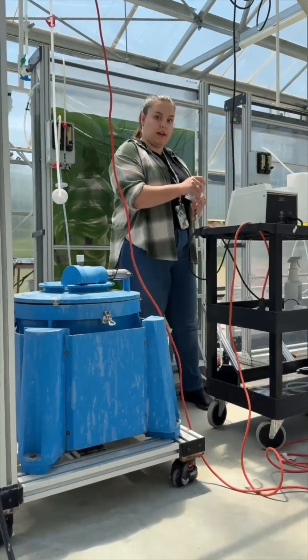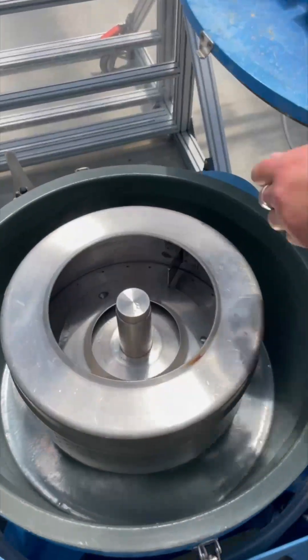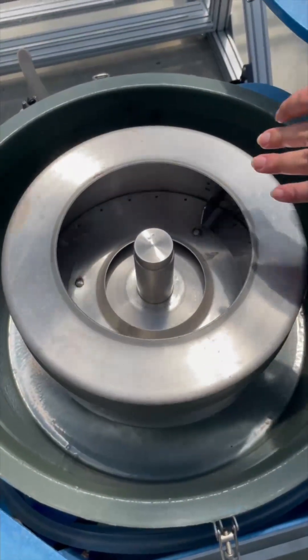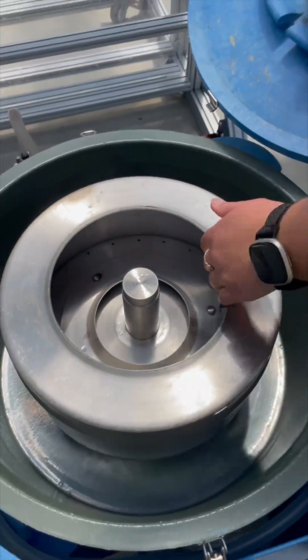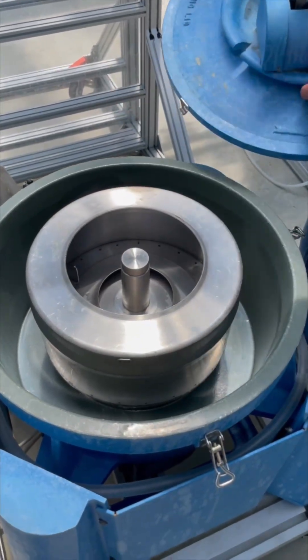This is going to harvest overnight, so it's going to be pumping through this tubing and into the centrifuge all night. It pumps directly into here, and then it just spins around. All of it's going to get stuck on the sides of the drum here, and then the waste goes out through the tubing there.